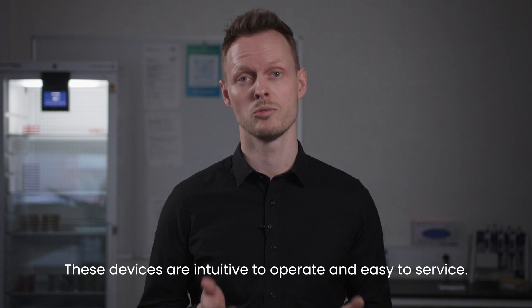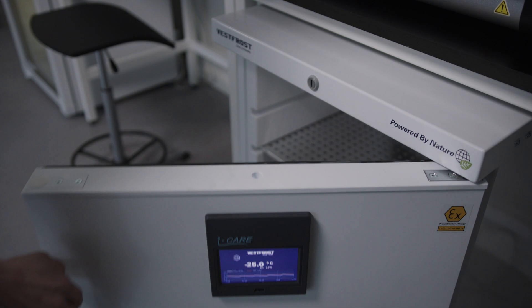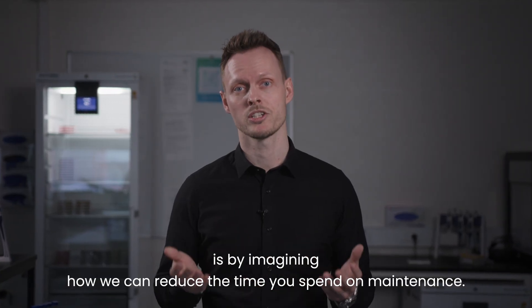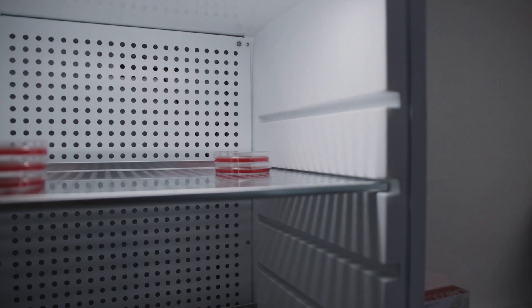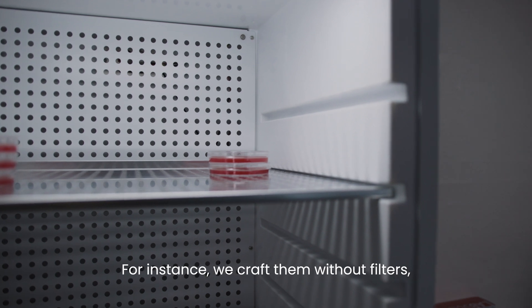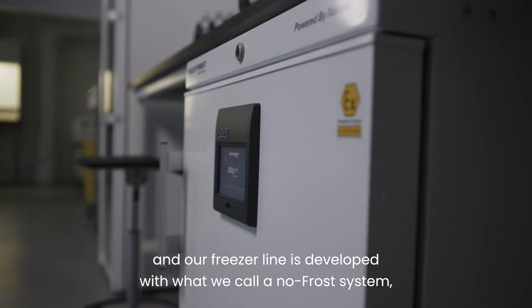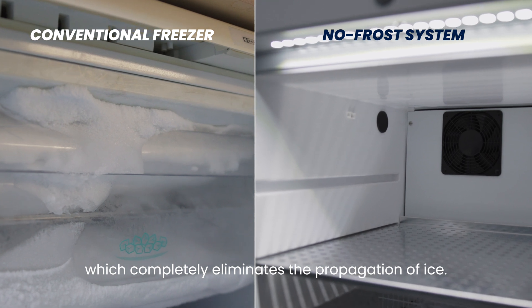These devices are intuitive to operate and easy to service. One of the ways we make our appliances user-friendly is by reducing the time you spend on maintenance. For instance, they are crafted without filters, which means you don't have to clean or change them. Defrosting is also done automatically, and our freezer line is developed with what we call a no-frost system, which completely eliminates the propagation of ice.